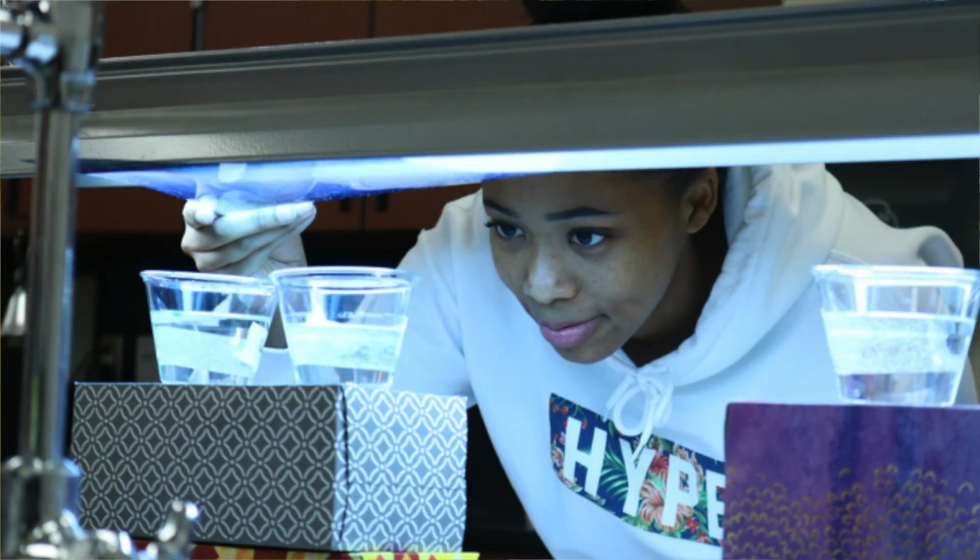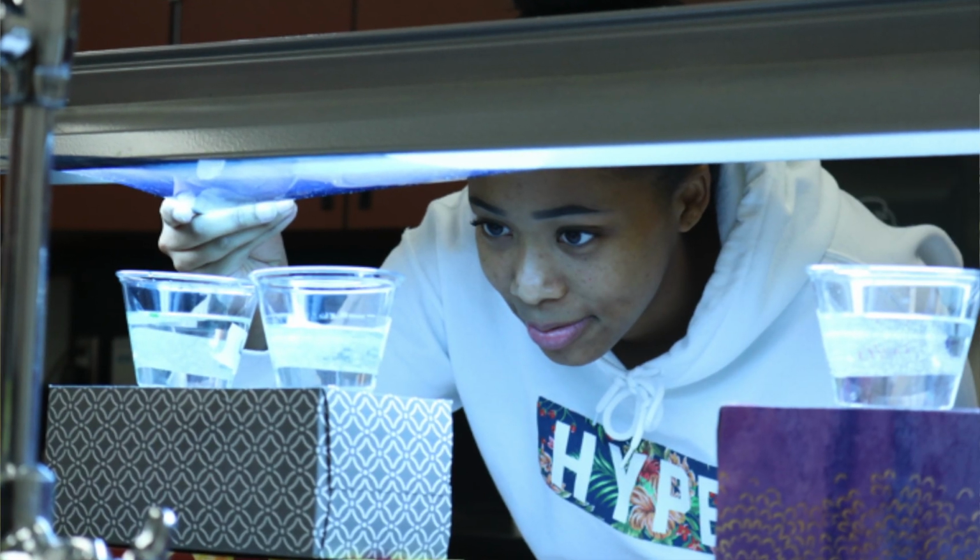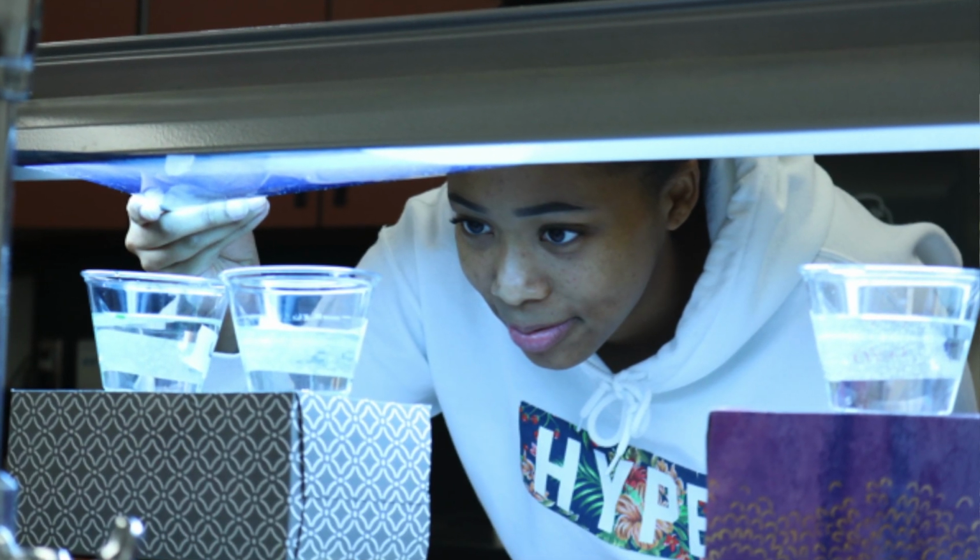They can choose an independent variable, such as the wattage. So I might provide for them a number of different bulbs of different wattages. How does light intensity affect photosynthesis? Another lab group may choose to investigate the concentration of sodium bicarbonate. I had another lab group that investigated how wavelength influences photosynthesis rate.